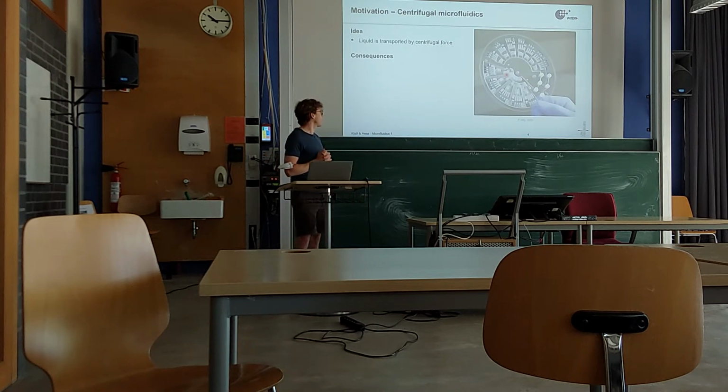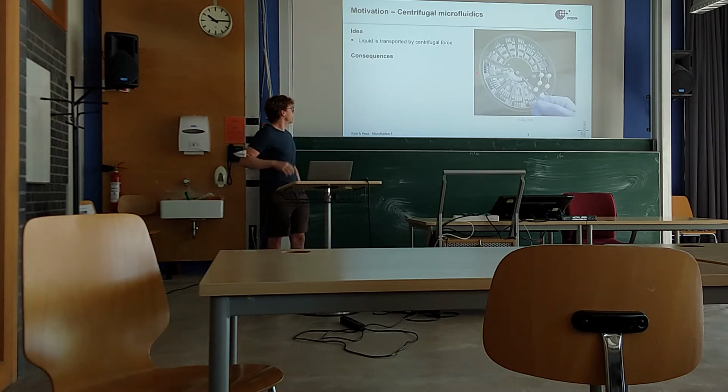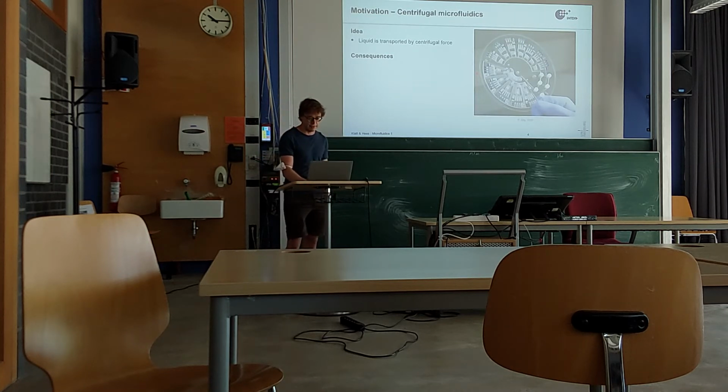So that's one of the biggest advantages that there is. One of your friends has said that you don't really require pumps. And that's the main advantage that you have. So in principle, you can just inject liquid, press start, and then your protocol runs. And you don't have any tubings or channels that connect your cartridge to the external pumps.